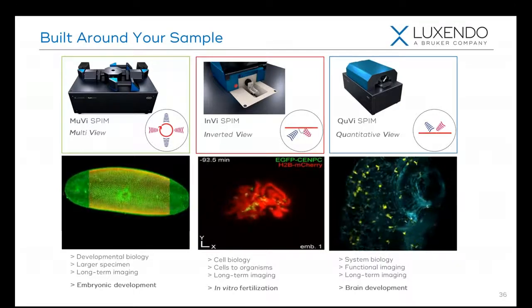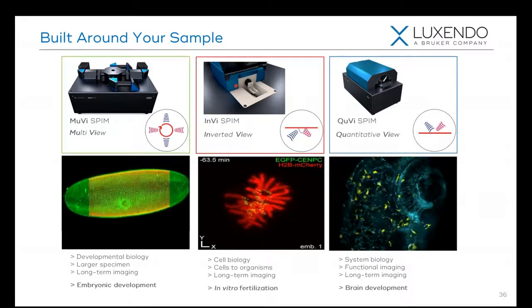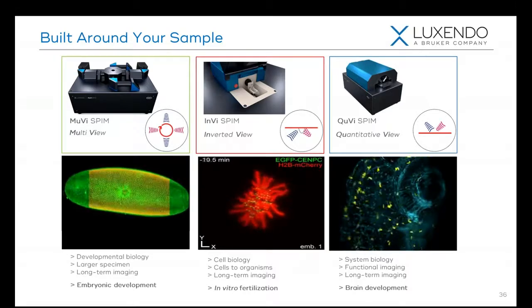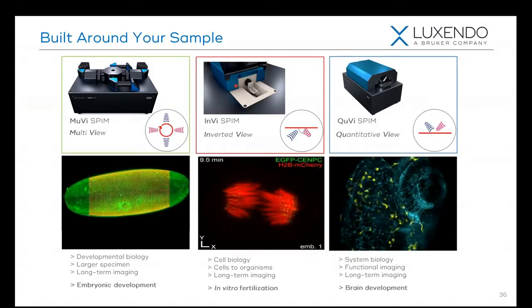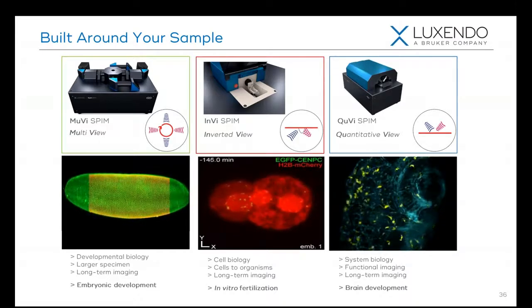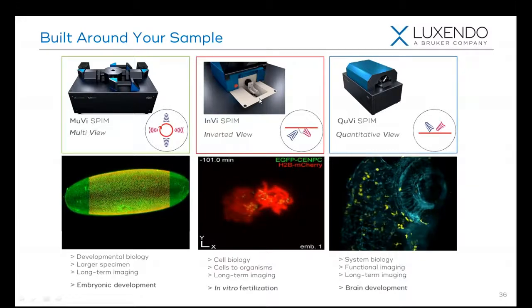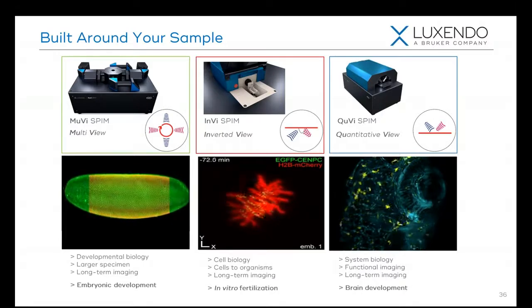It actually isn't difficult. It depends on your sample. So for cells, because the FEP is a little bit hydrophobic, we tend to coat this with some collagen or polylysine. And once we do this, they'll lay down like they would on any glass surface. For organoids, embryos, and spheroids, this actually is an extremely easy way of mounting it because we can just physically drop them into the chamber, line them up, maybe 10 or 20 depending on the size, and then serially just image each one of these individually to get us a real high throughput way of performing our imaging.